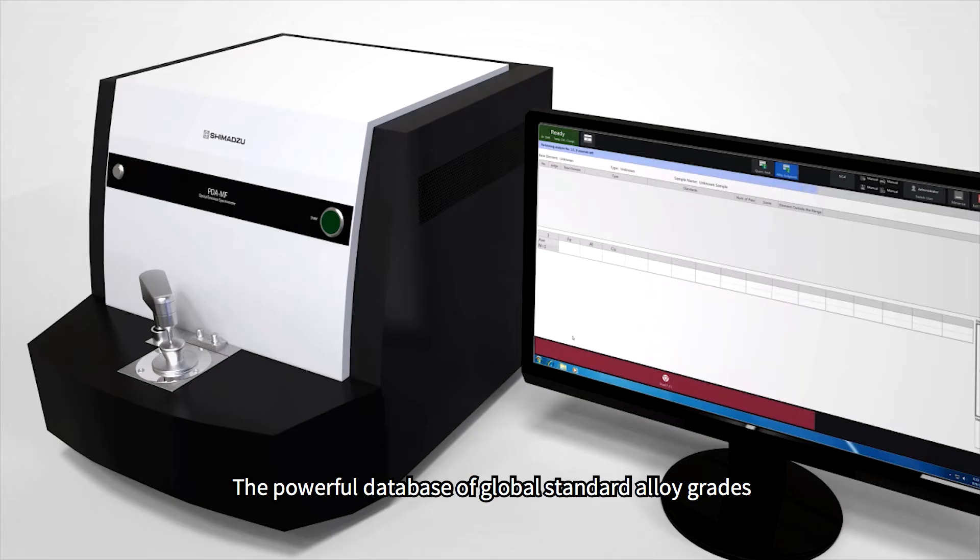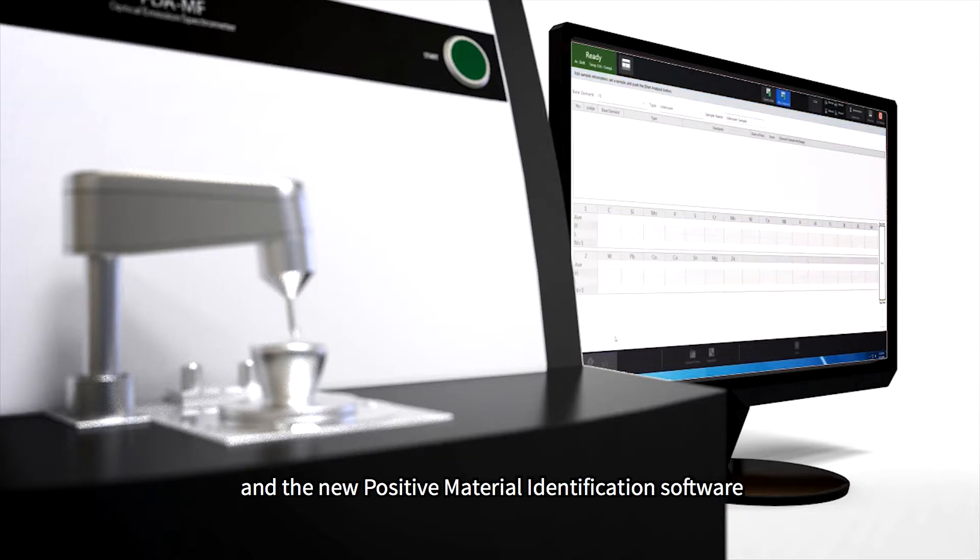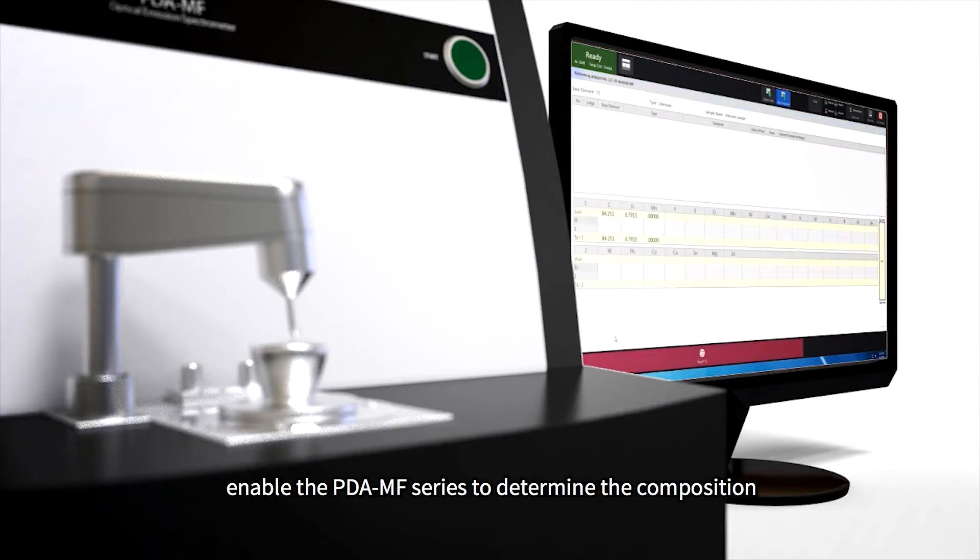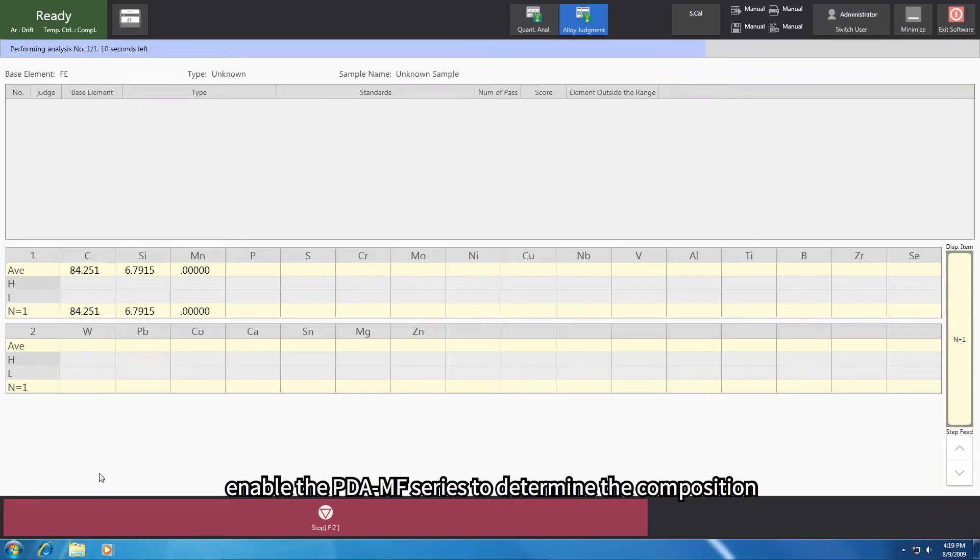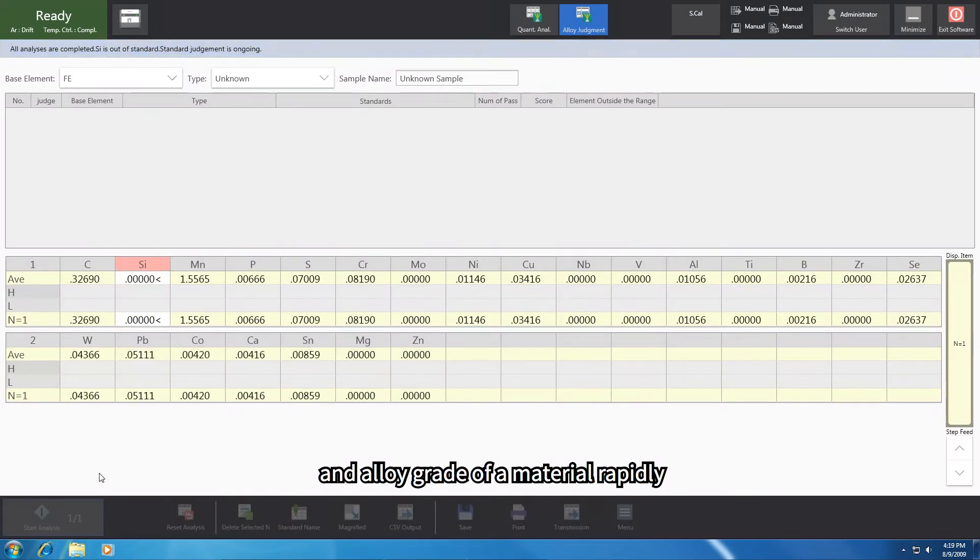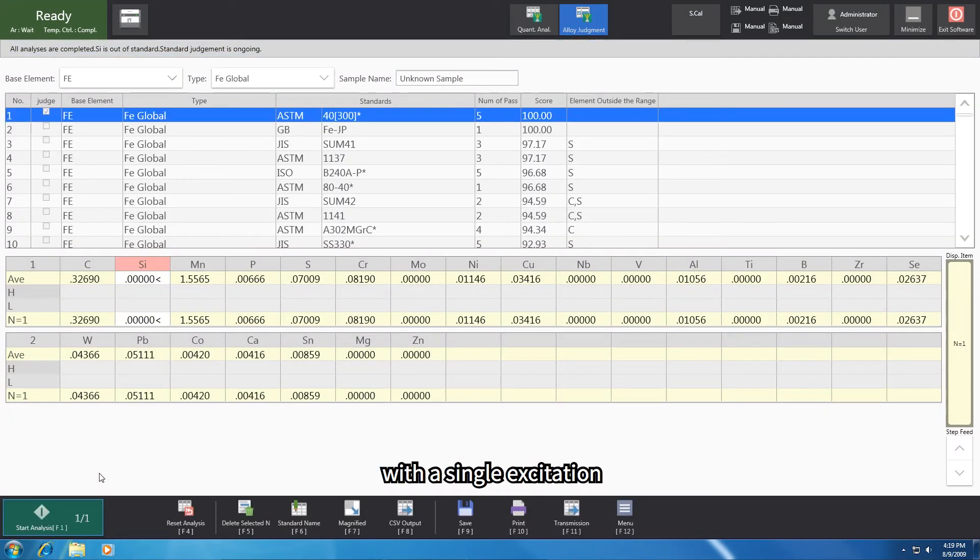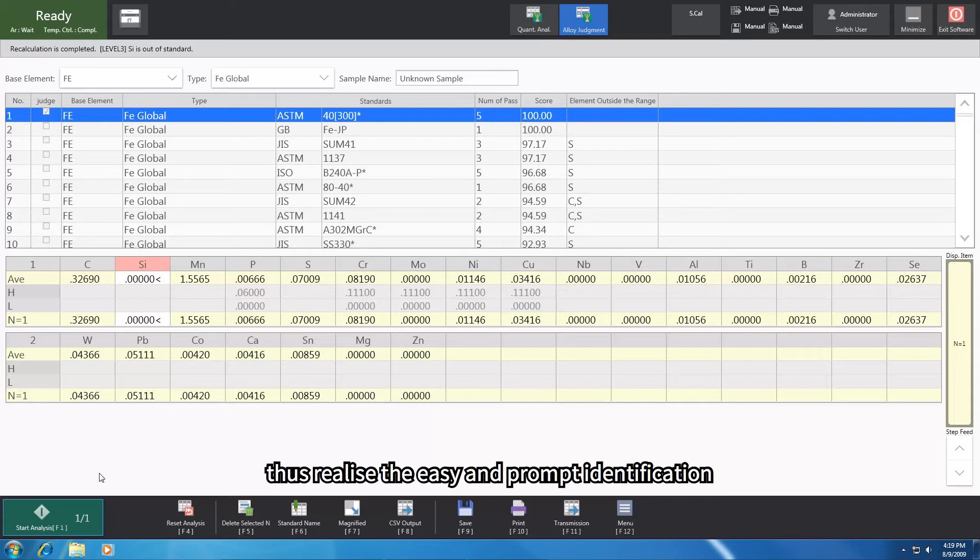The powerful database of global standard alloy grades and the new positive material identification software enable the PDAMF series to determine the composition and alloy grade of a material rapidly, with a single excitation. Thus realize the easy and prompt identification and analysis of unknown samples.